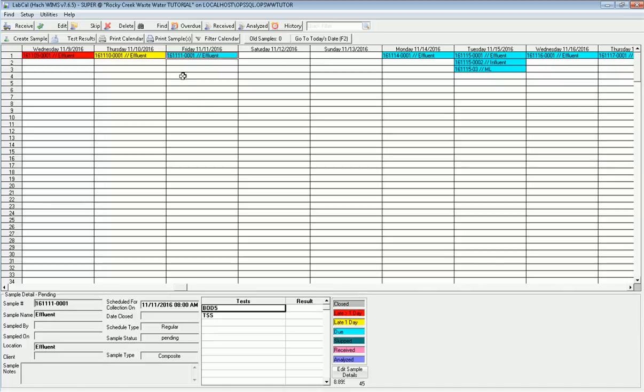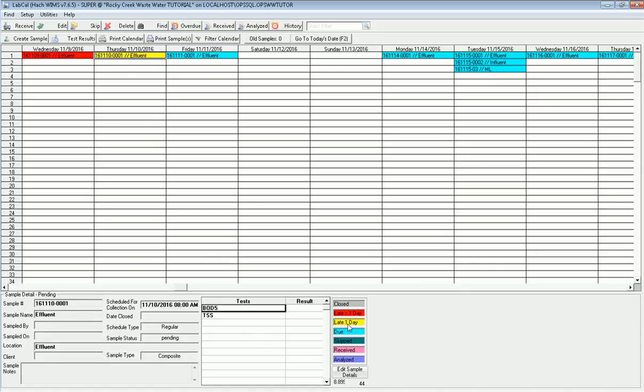Today is 11-11-2016, so it shows that I have an effluent sample due, and the tests or analytes that I need to run are my five-day BOD and my TSS on that particular sample. If I look at yesterday, it is in yellow because it hasn't been marked as received yet, so it's telling you that this is late one day. The red sample is more than one day late.